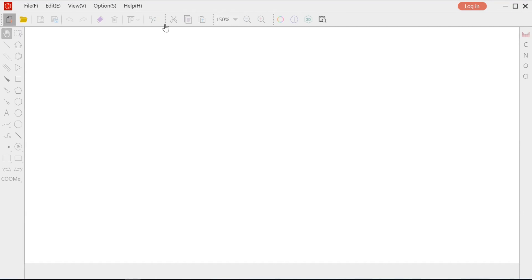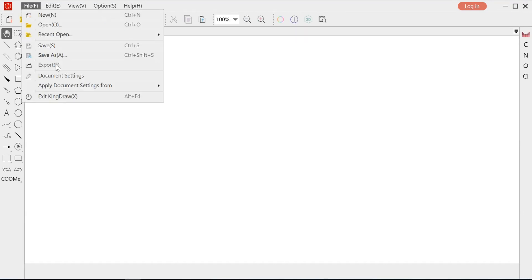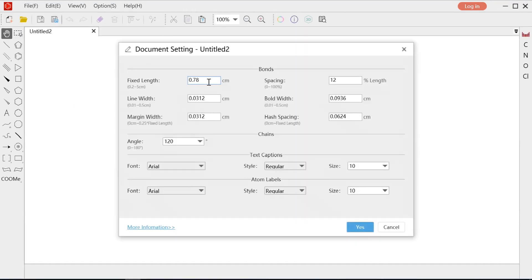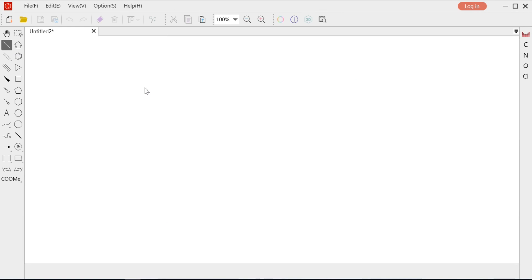First, open a new canvas and you can change the document settings here. I think the default setting is enough for today. Locate the toolbar here and select the bond tool.